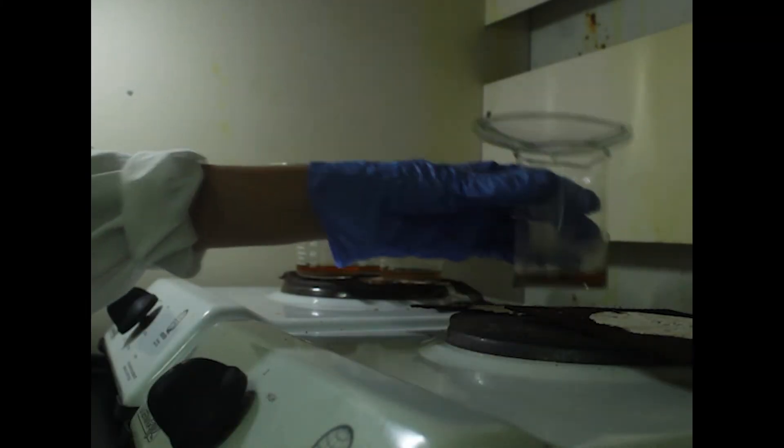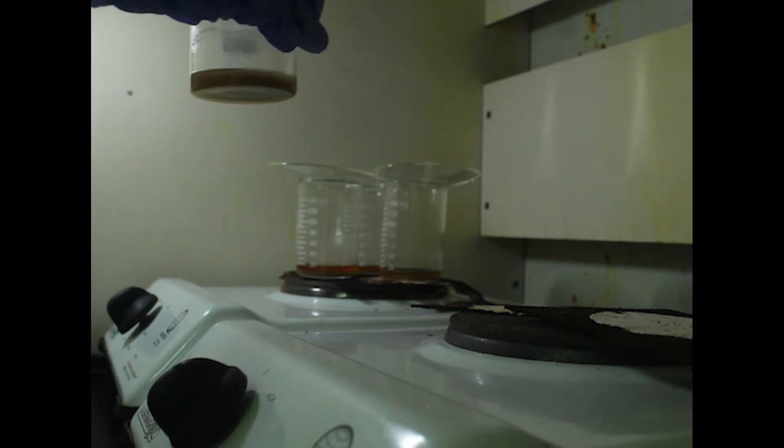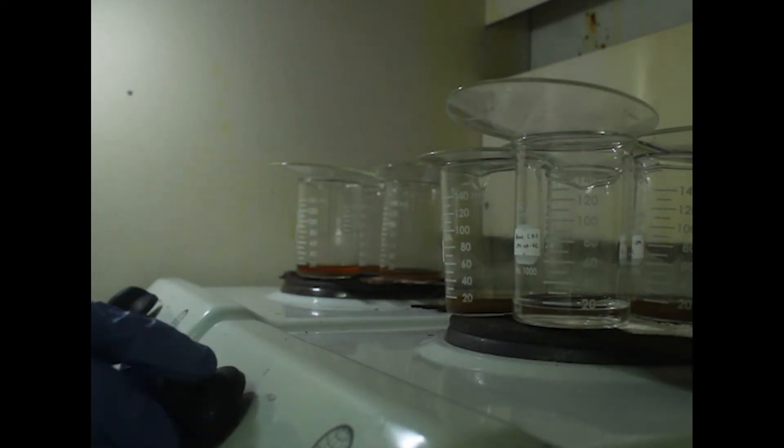I'm doing this process in a fume hood because it releases toxic fumes. The fumes can irritate your nose and respiratory organs and the smell can be disturbing to the other employees, especially those who are not used to handling or working with laboratory chemicals.